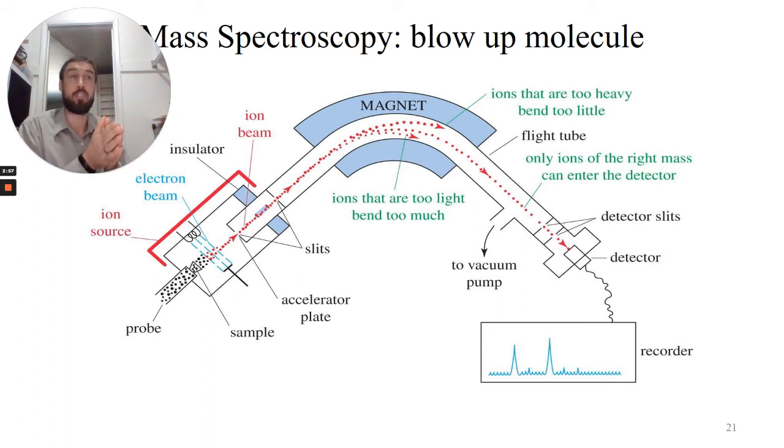And now our detector just says, well, what hits me? And it correlates that time to a particular mass. And that's about it. So if we were running it, we might see nothing hit the detector. And then at 20, we see 20 particles hit. Okay, now it says, well, 20 things hit me. And now at 21, nothing's hitting me, and so we get a flat line again. And now at 32, I get 400 particles hit me.